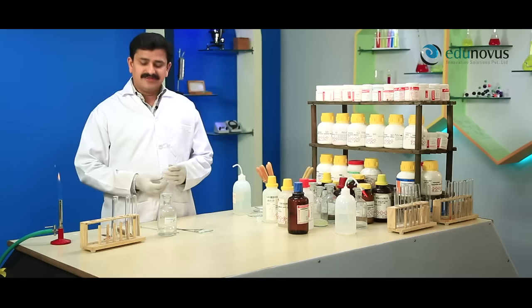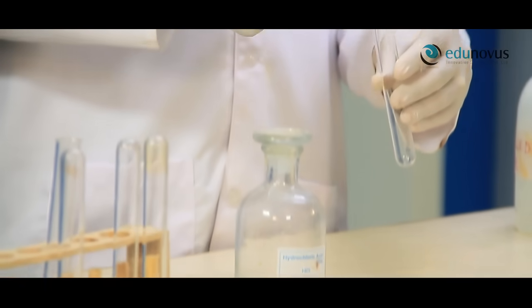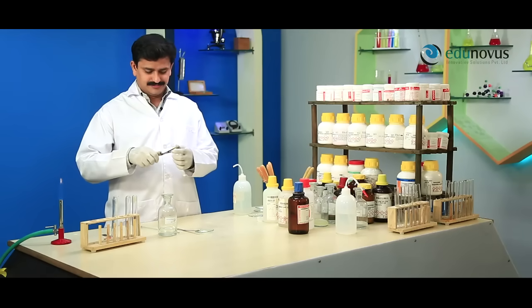Take a small amount of given salt in a clean and dry test tube. Heat it on Bunsen flame.